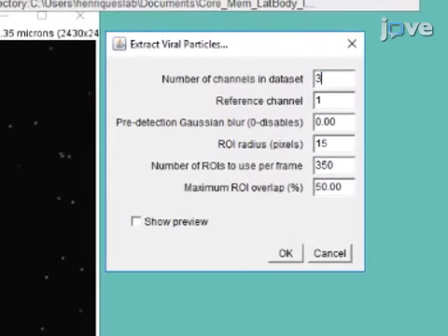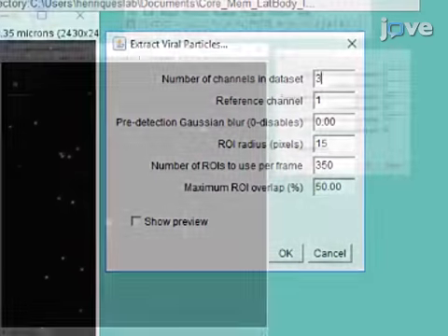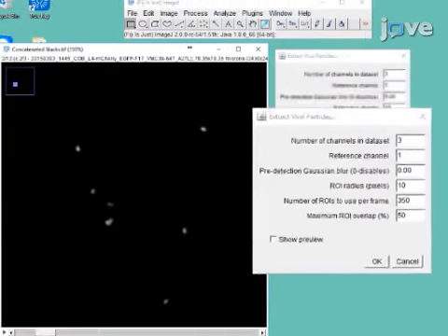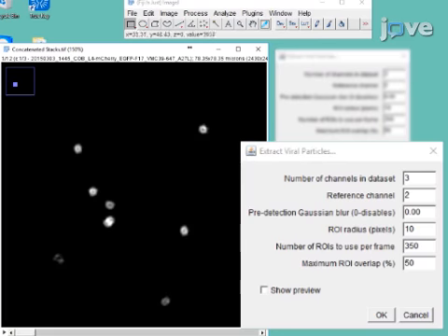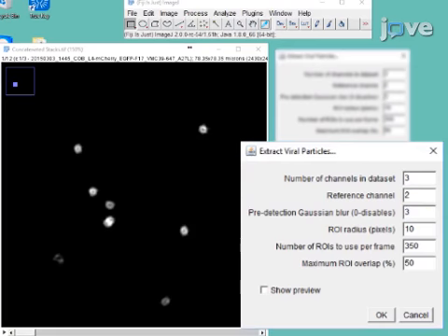Fill in the number of fluorescence channels imaged. Set the reference channel to the fluorescence channel in which the particles have the most consistent appearance. If those particles lack a central maximum, apply pre-detection Gaussian blurring to induce the appearance of one.